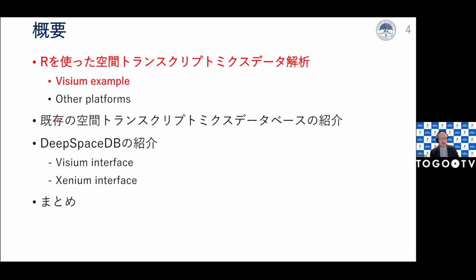And then, this is the content for today. Briefly, I want to show a simple example about R and how to analyze a Visium sample. And then I want to introduce several databases and more deeply show about our own database.